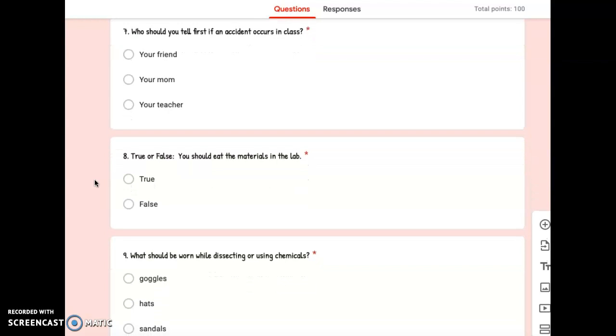Number seven: Who should you tell first if an accident occurs in class? Your friend, your mom, or your teacher.